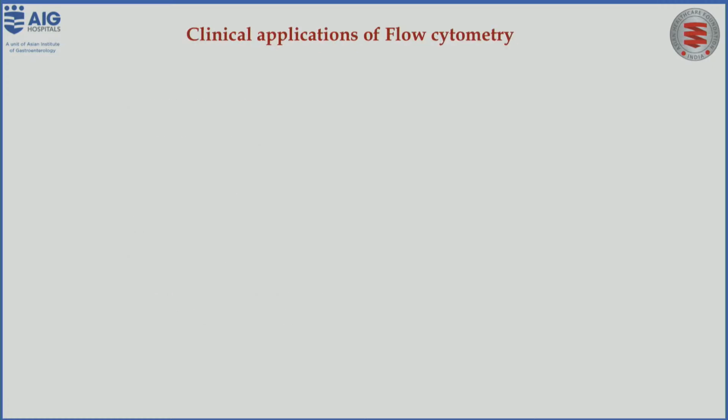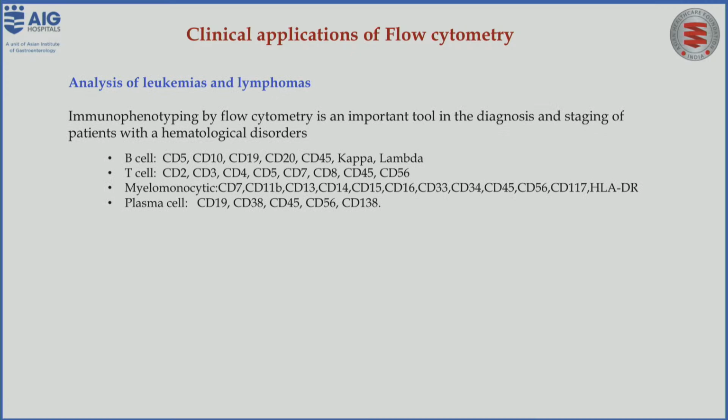Next I will cover a couple of the clinical applications using flow cytometry: analysis of leukemia and lymphoma cancer. In detail, Dr. Bala will explain in his presentation. Immunophenotyping by flow cytometry is an important tool for the diagnosis and staging of patients with hematological disease.